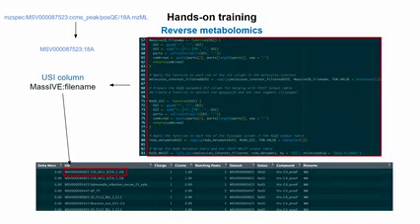And from here, once you did the fast search, it takes the USI of your molecule of interest, your unknown feature or known molecule. And then it will match and collect all the different USIs from the public domain that are identical or similar based on the cosine and matching peaks. And then what we need to do after that is to integrate the metadata.